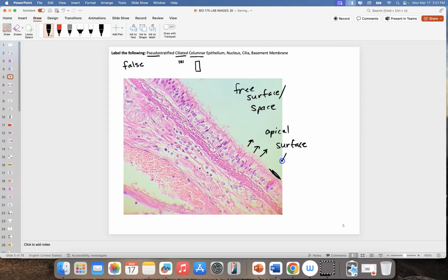This surface right here. And then once the epithelium is over, once that layer is complete and finished, then this is going to be our basal surface. So this is where we're going to have, again, that basal lamina. And then beneath that is where we start getting into our other tissues. Remember, epithelial first, then connective tissue, then muscle and nervous tissue.